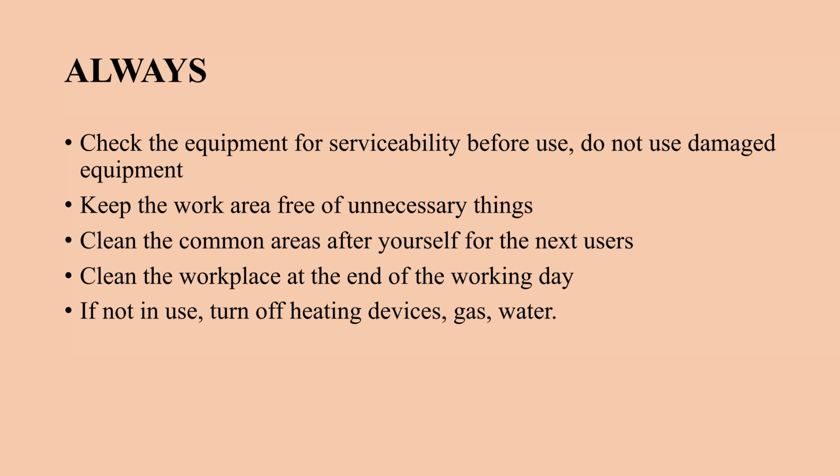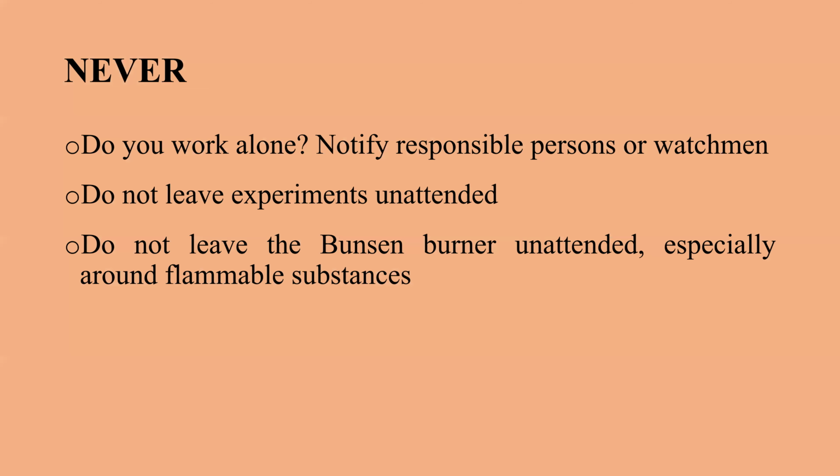In the lab, we should check all equipment before we use it, remove damaged equipment, and keep the working area free from different things, trash, and unnecessary things, and clean the workplace at the end of the working day, and turn off all water, gas, and electricity, because it can lead to some emergency situation.